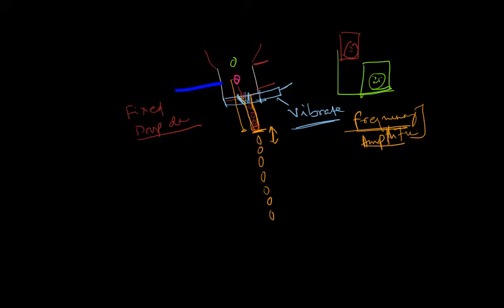So how it happens is, first we have made a detection, then it will be deflection. How do we deflect the cells into the desired direction?